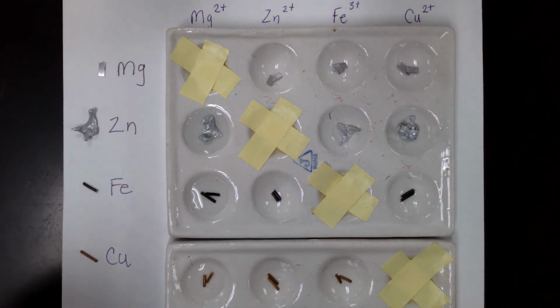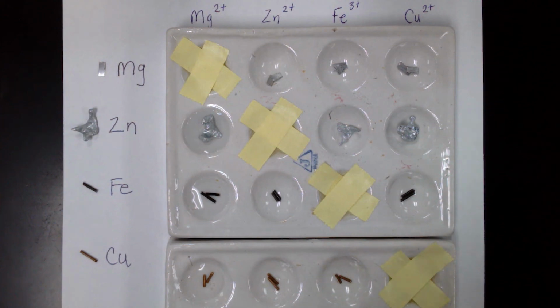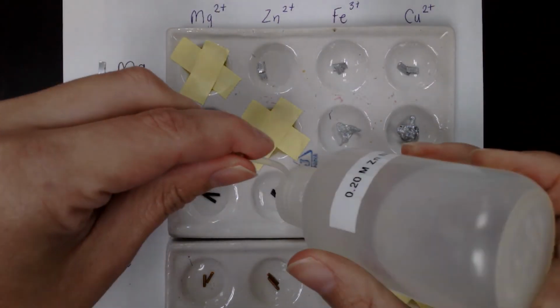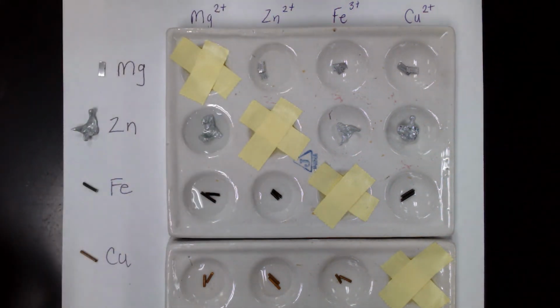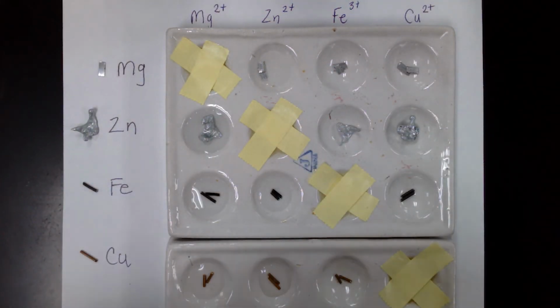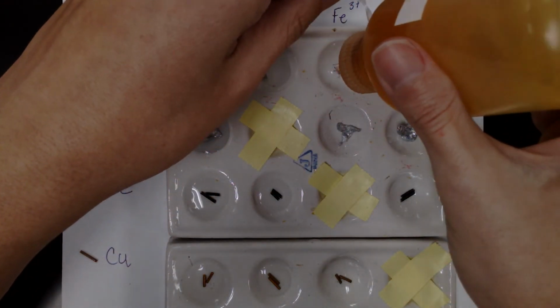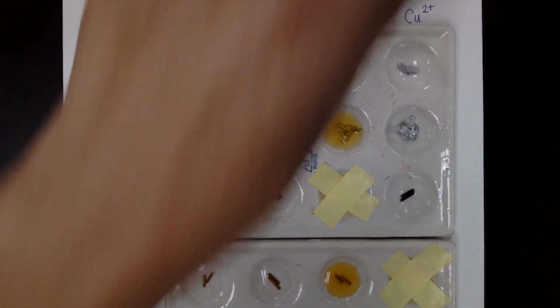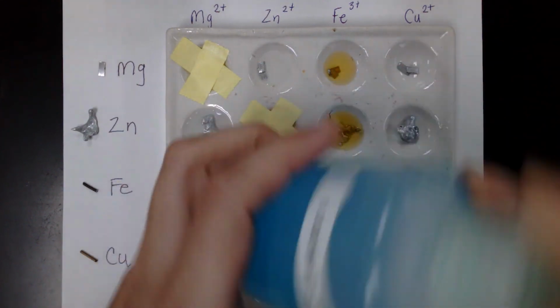So next we have our zinc nitrate solution. So we're going to fill in here. So moving along, next we have iron. This is iron 3. And finally, we have our solution of copper ions.